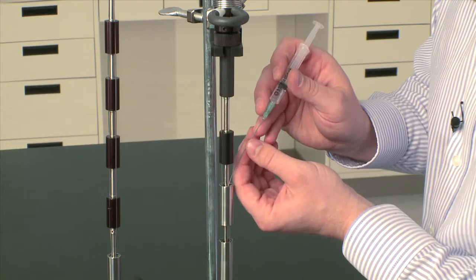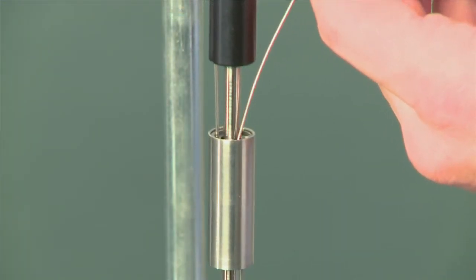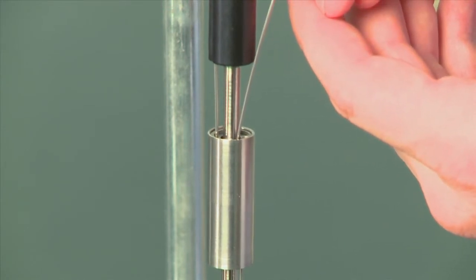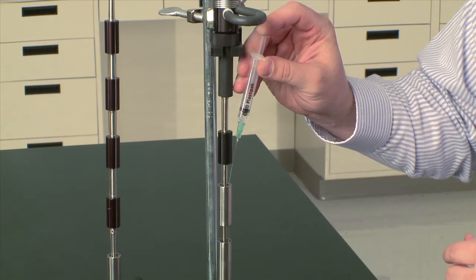You have to go through an O-ring, so you have to be quite careful. Once you find the bottom, put the needle all the way to the bottom and slowly inject the water to fill the humidity chamber.